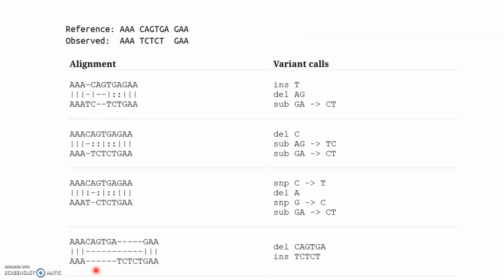And obviously, the tool that we use will impact our downstream analysis, because how it aligns that short sequencing read to the reference will ultimately determine what variants are called in which position. So you can see all of the different sequencing aligner tools that we just mentioned are published in the literature. They're well vetted. They've been used a lot of times. They all give us different results, and it's with the same sequencing read.